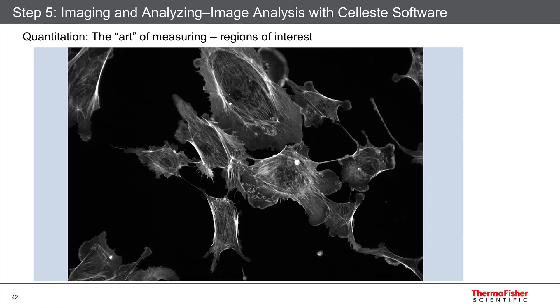Now, once you've taken your image, how do you measure it? A publishable image isn't just about its appearance — it's also about the data that you get out of it. How do you measure that data? Well, here, using our Celeste software, is an image of some actin-labeled cells using a phalloidin. One way to get the data is using a region of interest. You can see some regions I've drawn around areas that represent bright signal versus background. On the left there, you can see a circle — that's the background I'm comparing against. And all those other regions, I'm measuring the average intensity of to get a value that I can compare between samples.